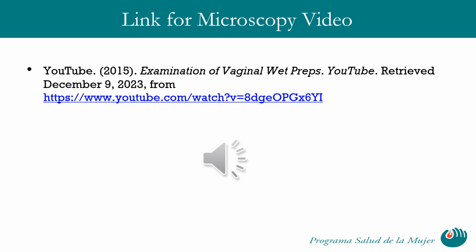Please click on the link to watch the 15-minute video that provides basic instruction on preparing and examining vaginal wet preps. Thank you.